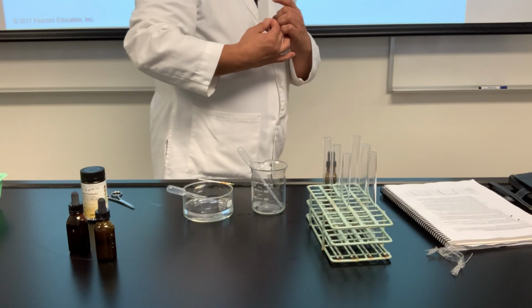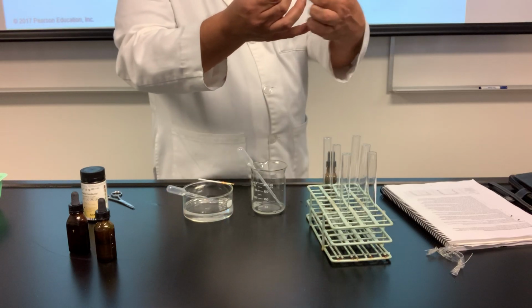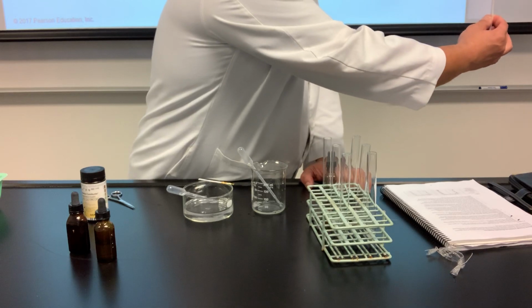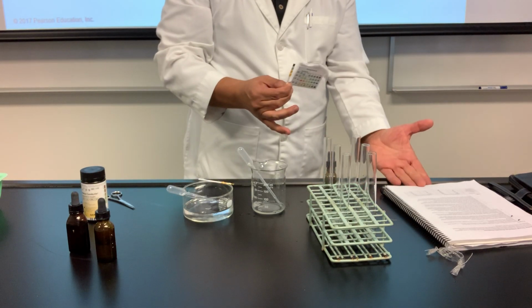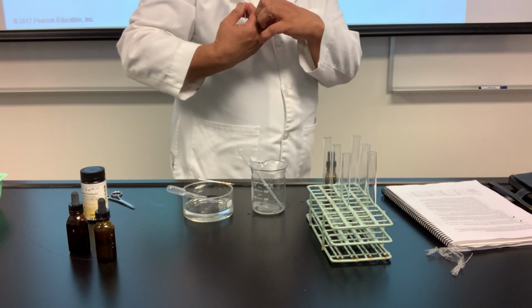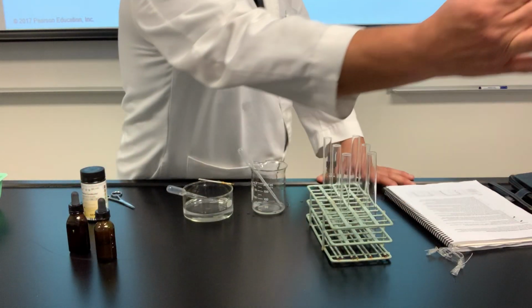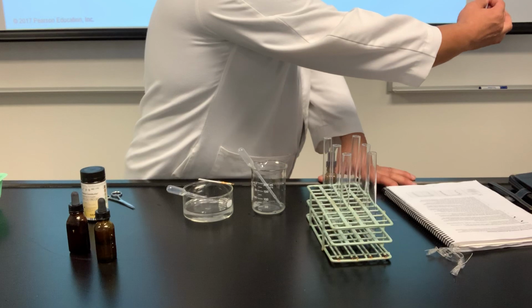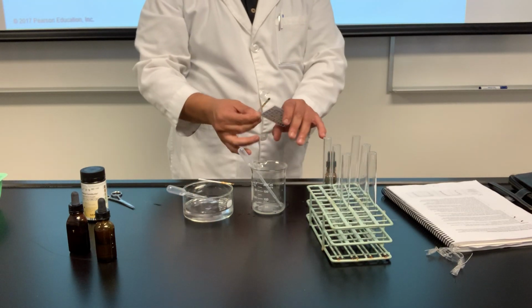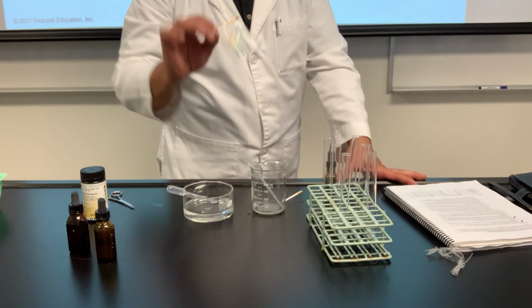And we notice that the top one is for glucose. What do you guys think? Does it have glucose? I don't care how much, but does it have glucose? What do you think? Yes. Yes, it does. Well, we know that because we put it there, right? Because that's the inside solution. Okay, the second one is protein. Does it have protein? Yes. What do you guys think? Yes, that's the albumin. That's the boring one. We already know that, all right? This is the fun one, as fun as it's gonna get, all right?